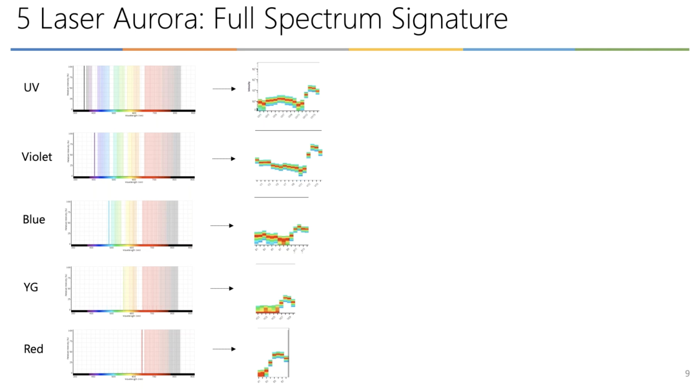So you're going to see that in some detectors we have very little light, very little intensity. In some we have more light. And these ups and downs are going to tell us which detectors are seeing more light depending on the wavelength of emission, and which ones are not seeing any, because at that wavelength there are not really photons coming from the excitation of this particle labeled with this particular dye.